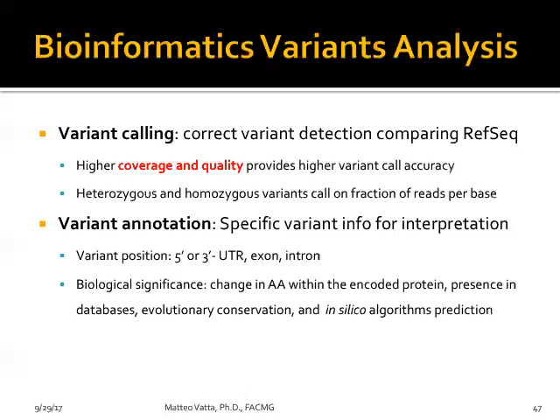Oh, well, but usually they did 2x50 rather than 2x150 because more reads usually leads to less coverage per point. Meaning at the beginning they were doing short reads because it was giving a lot of coverage, because the output is fixed per machine. So if you have, for instance, a 15 gigabases output, then with shorter reads you have more coverage.